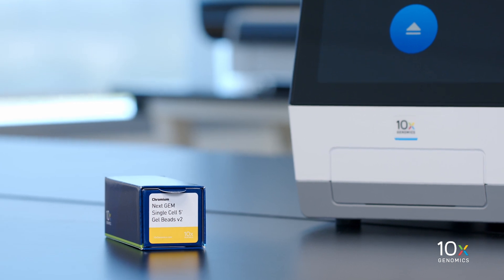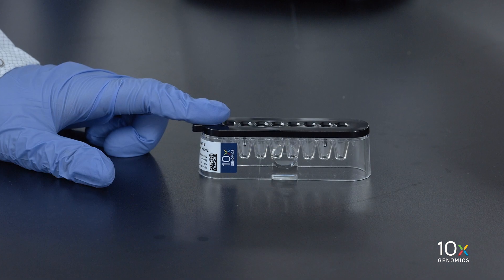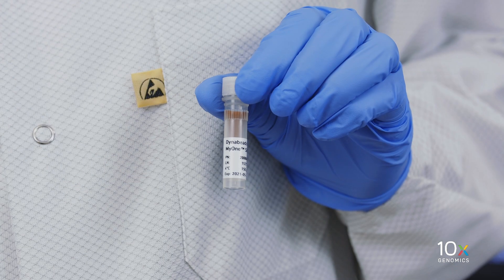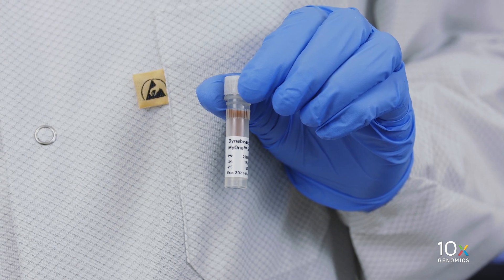The Chromium NextGem Single Cell 5' Gel Bead Kit V2 is stored at minus 80 degrees Celsius. The DynaBeads MyOne Silane are stored at 4 degrees Celsius.